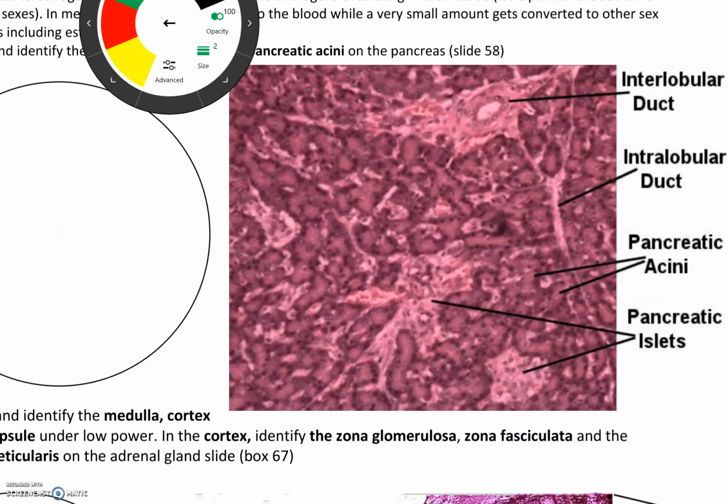Our next gland is the pancreas. Now the pancreas is frustrating for histology because we're looking for these little islands called islet cells, and they're in the sea of these pancreatic acini. Acini actually means berry. So when you actually look at the histology slide, you'll be looking and looking and looking. And a lot of times, people mistake this, which is actually a duct with connective tissue around it, for one of the islets. So I'm going to draw two islets here, pancreatic islets, or islets of Langerhans.